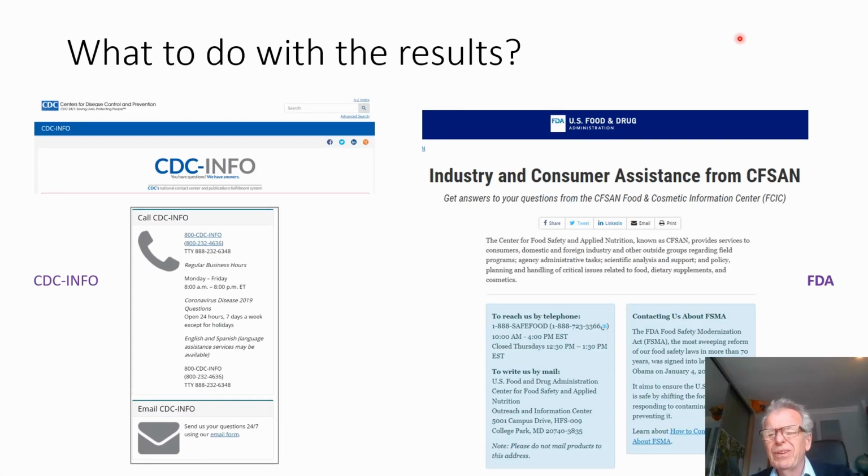What you can do if you find the results, well, at the end of the day, to me, we're dealing with neonatal health in particular. This is a very serious matter if you do find pairs of strains. The ones I've shown you are ones which probably the authorities are already aware of because they were sequenced by the FDA and then they get uploaded.